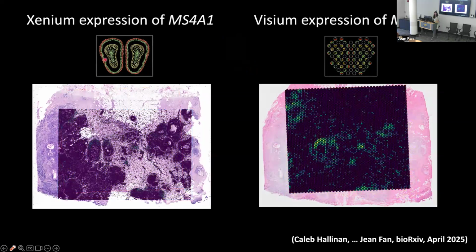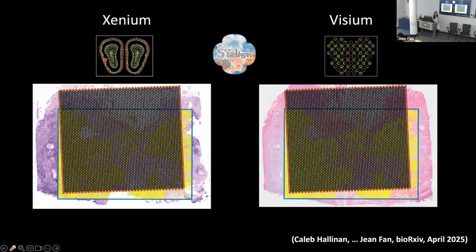So for example, if we look at this slide, you can even do FFPE versus frozen as well with these two tools. Great point. Both of these are FFPE samples. This is the Visium CytAssist FFPE based, so we're not doing polyadenylated sequencing anymore. Excellent question.